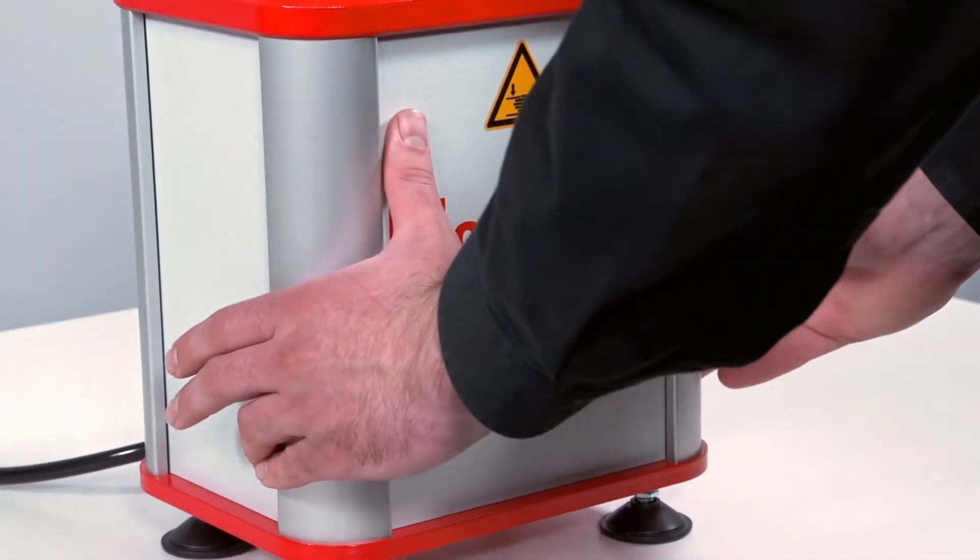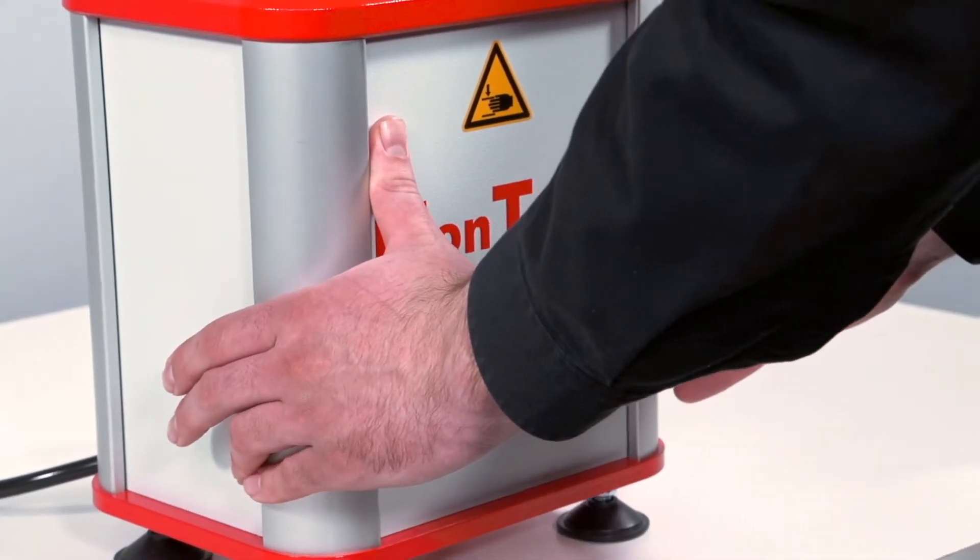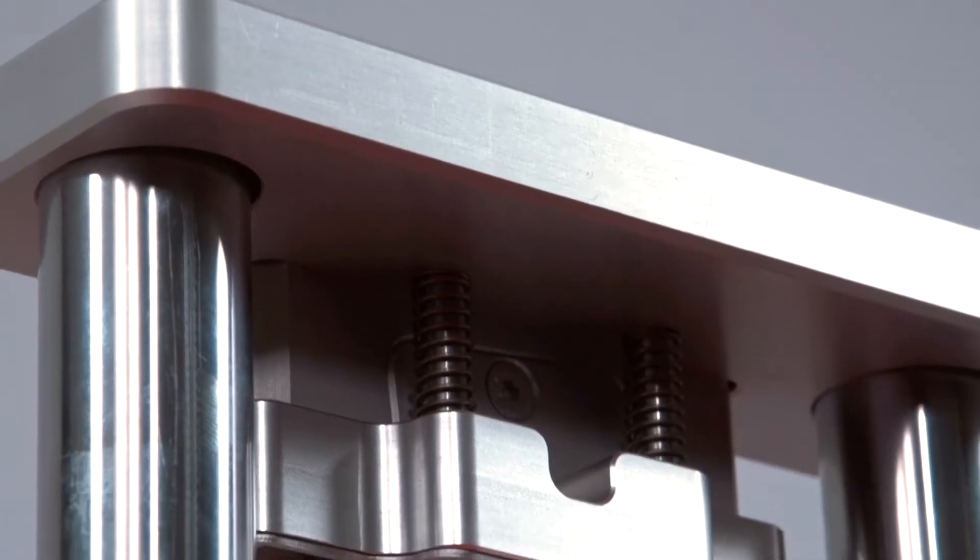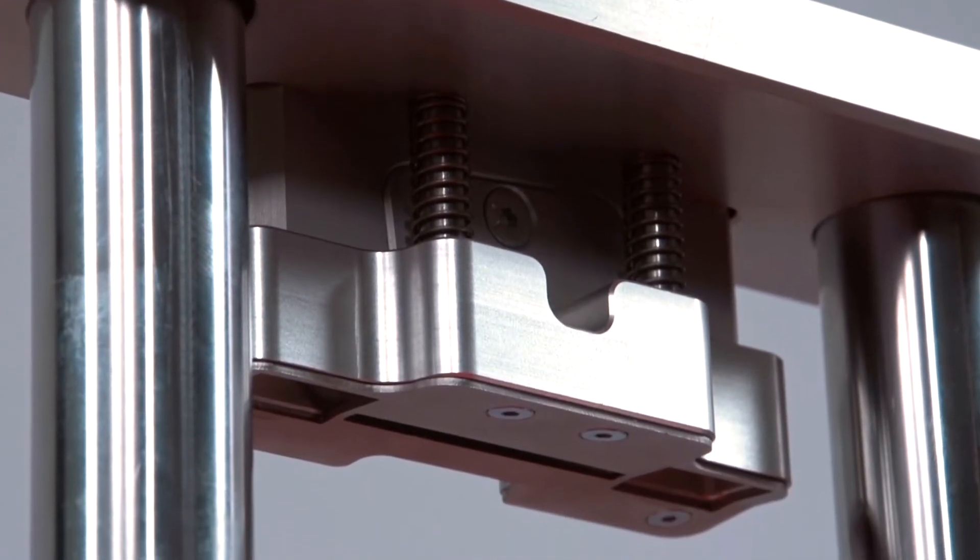With safety as a top priority, the DisperCut is equipped with two-hand operation as well as blade covers to prevent accidental cutting or contact with the blade.